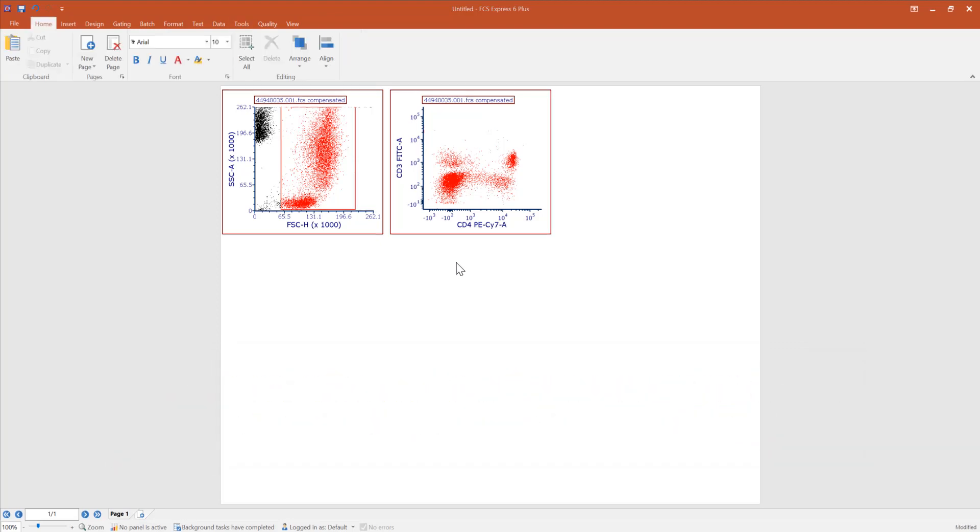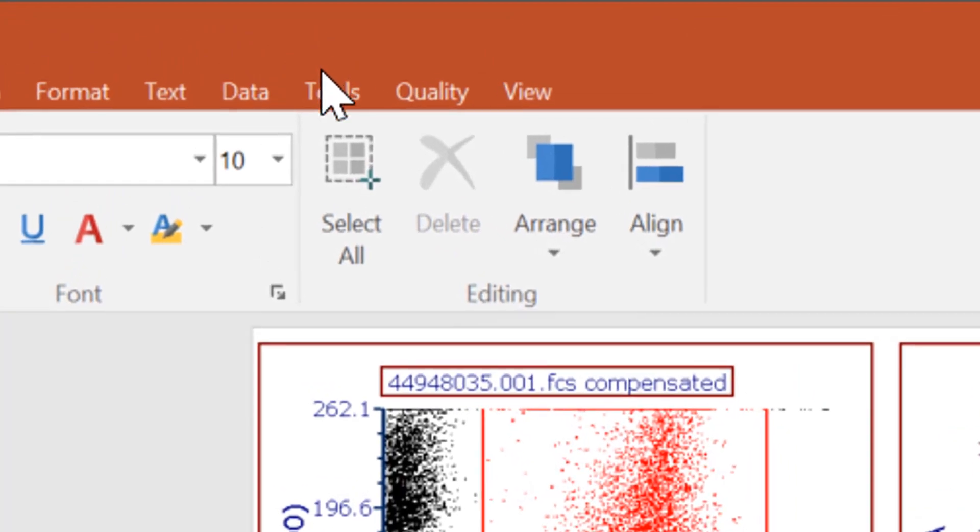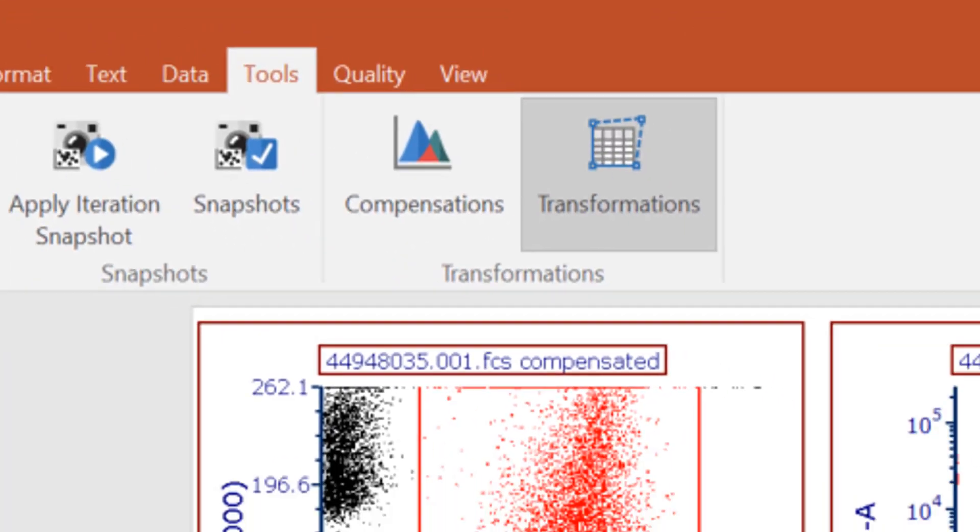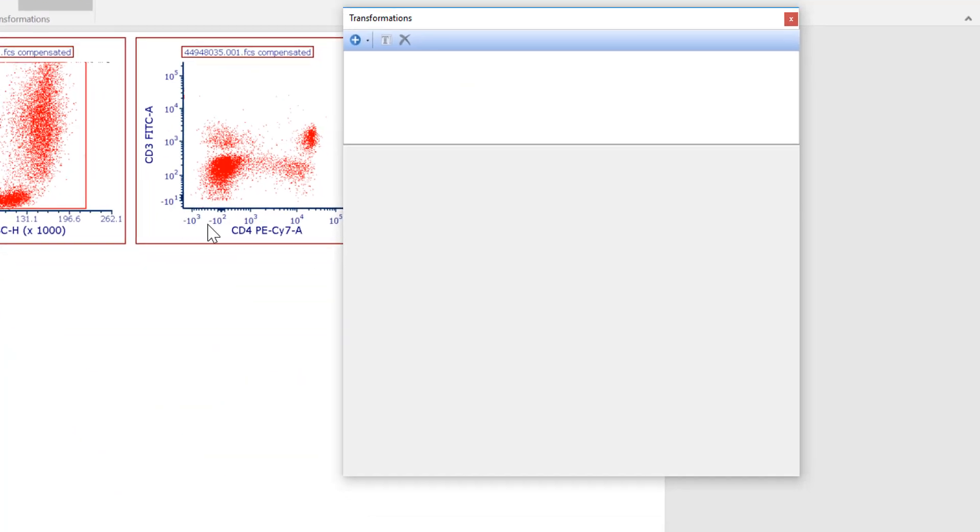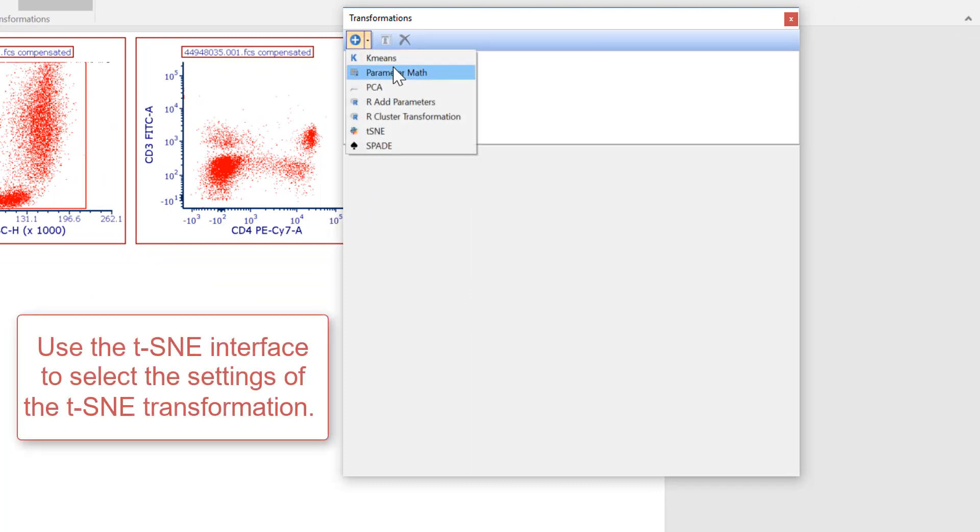To access the t-SNE interface, select the Tools tab in the ribbon. Select Transformations. From the Transformations window, add a new transformation and select t-SNE from the drop-down menu.